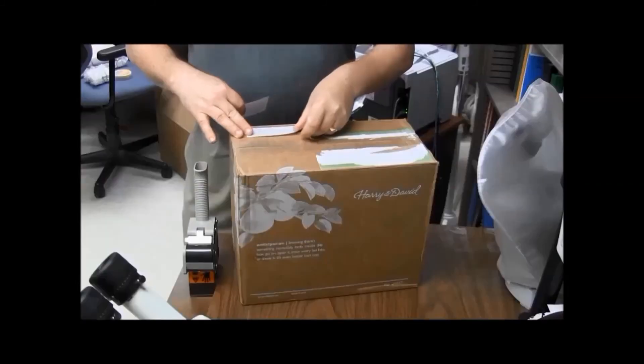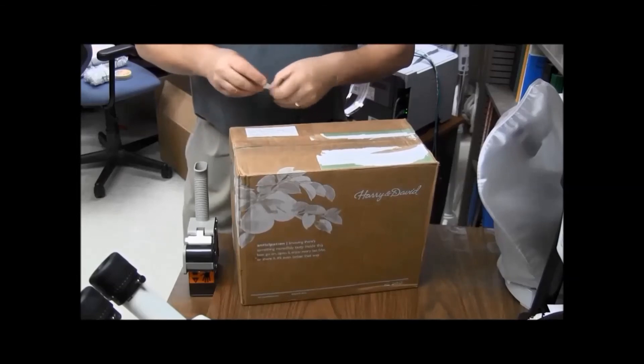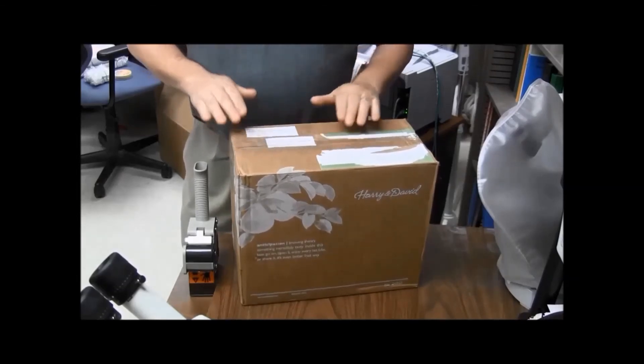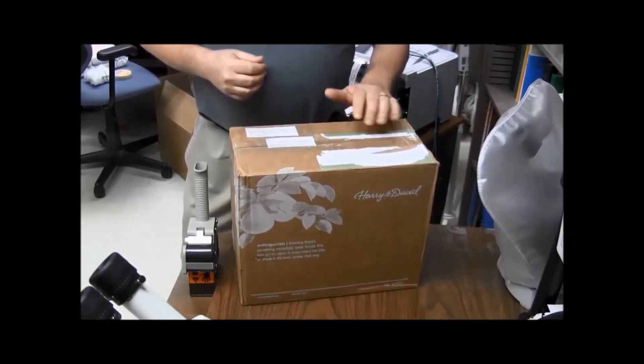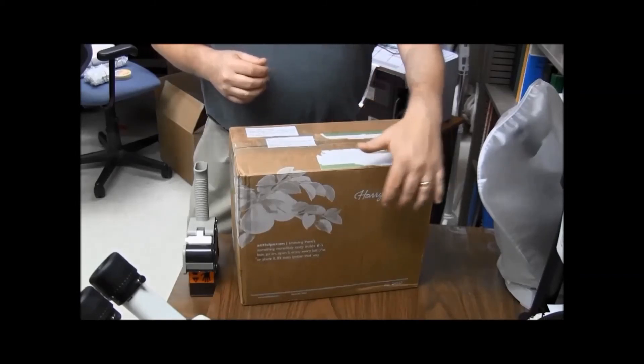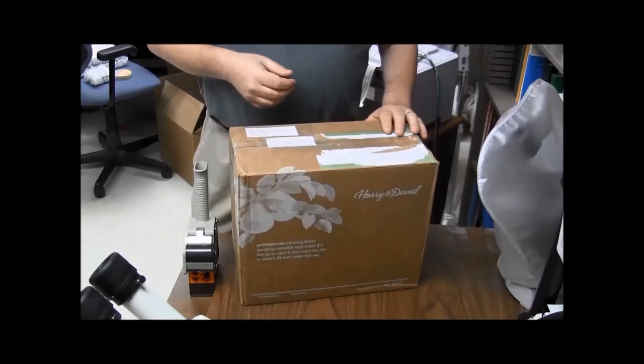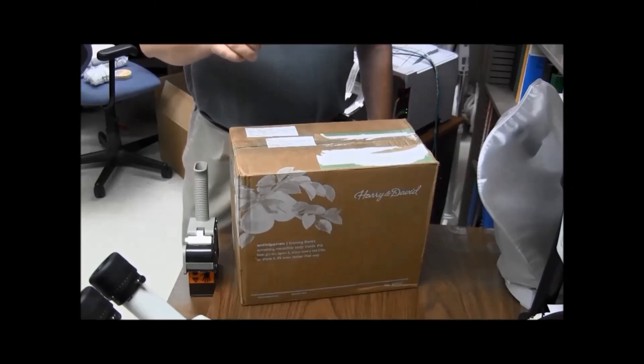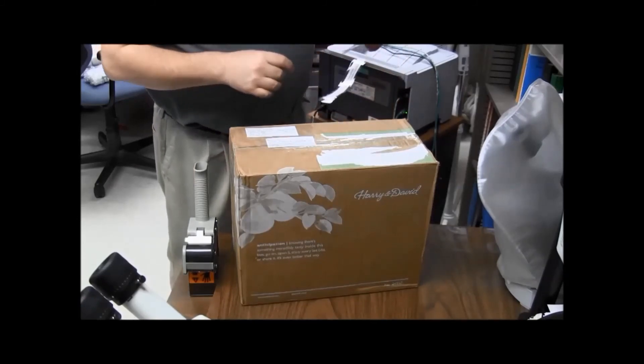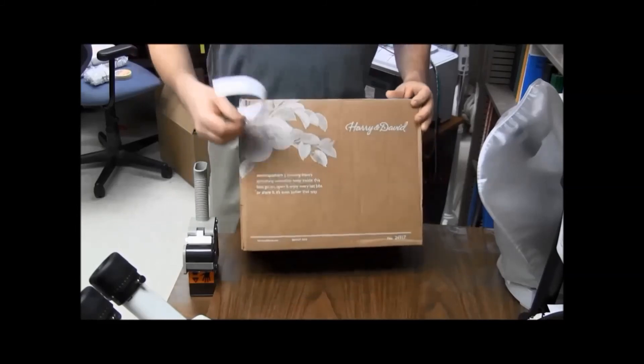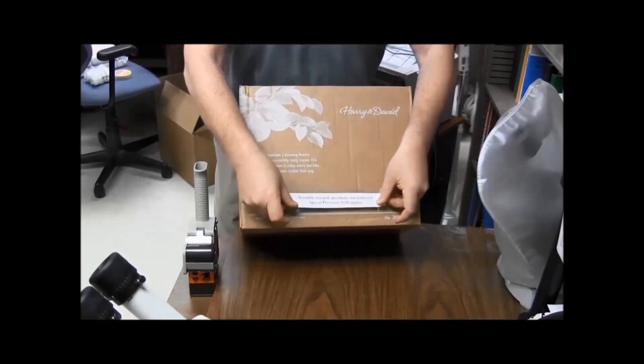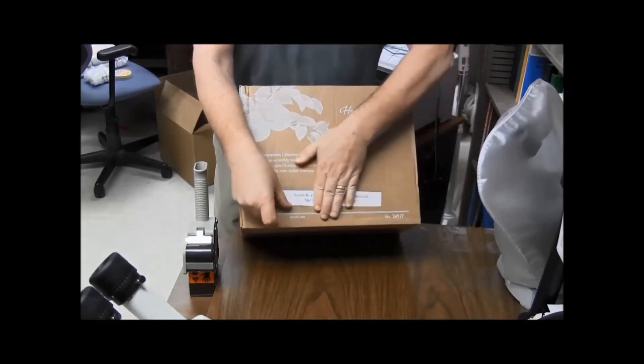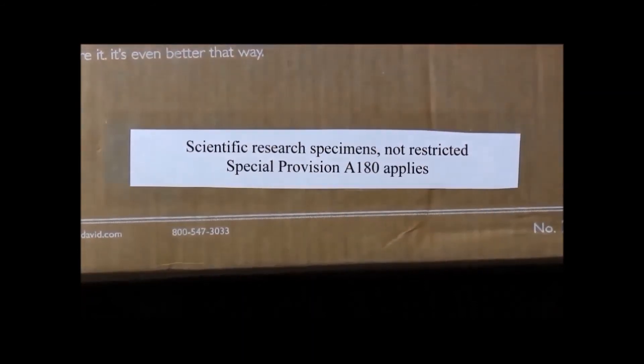And then you're ready for labels. So from the label, FedEx likes you to leave plenty of space in the box so they can put all their labeling in. And then when we ship under this special provision A180, you're required to label the box.